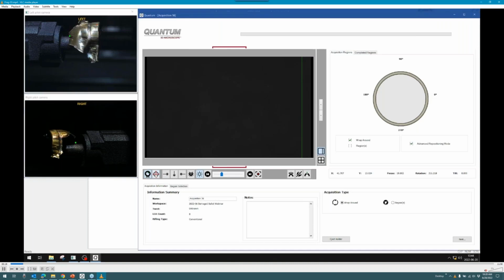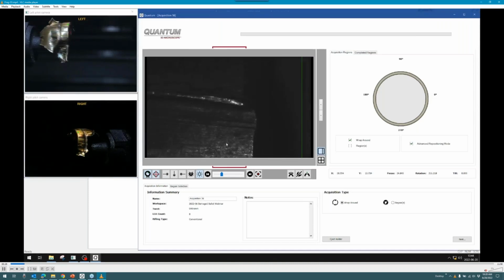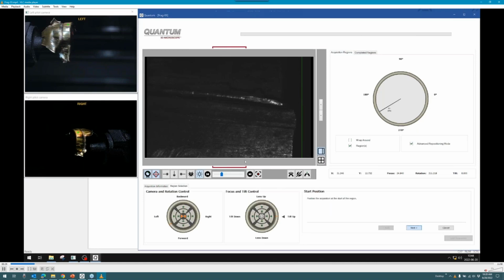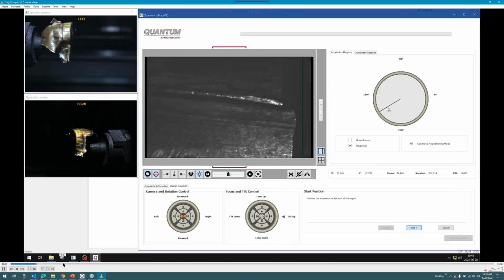Find the base of the bullet, go to the base, and now from here, I know I'm looking at land impression number 2. 1 is somewhere up here, 3 is somewhere down here, but I know exactly where I need to transition to work the surface of this acquisition. Let's jump around here for the sake of speed.